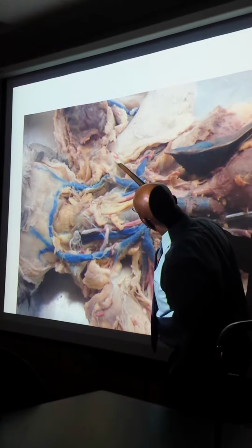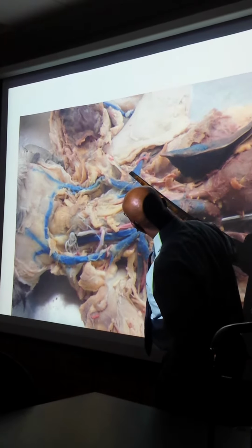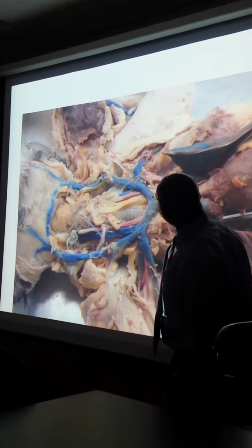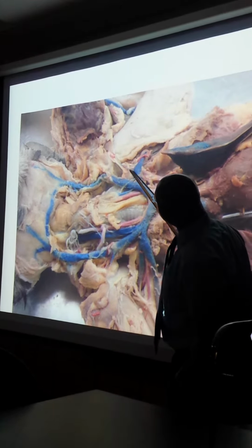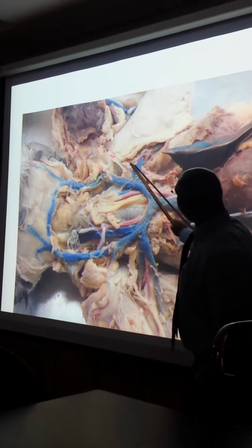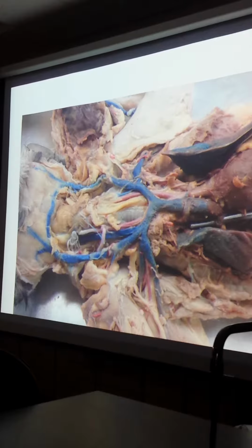This may be part of the thyrocervical vein, which also has an artery coming up here. You see this kind of reddish hint over here? We'll kind of look for it when we go to the actual cat, okay? But there's some pictures that kind of show it nicely. It's thyrocervical, it's kind of going towards the neck up here, and it branches from somewhere on the subclavian here.